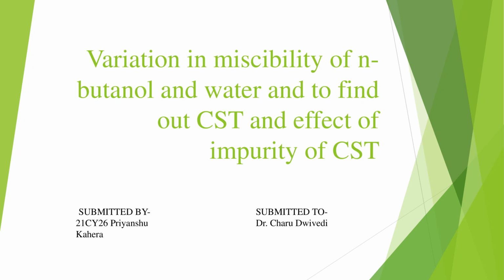Ma'am, today I, Priyanshu Kahera, will be explaining the experiment on critical solution temperature. In this experiment, we will measure the variation in miscibility with temperature and find the effect of impurity on critical solution temperature. The system we are using is the N-butanol and water system.